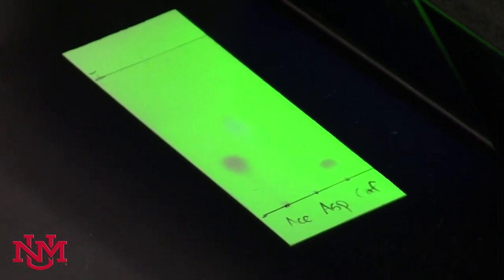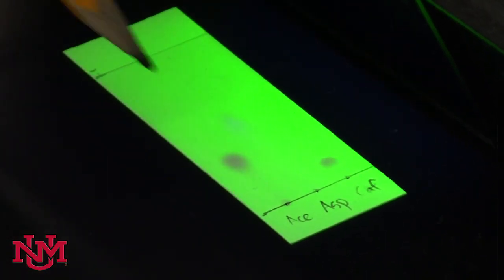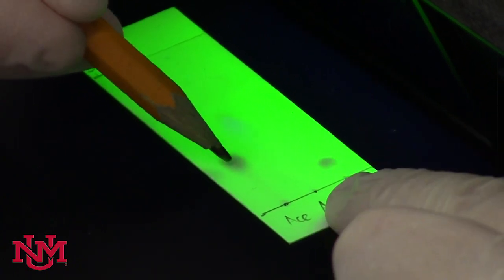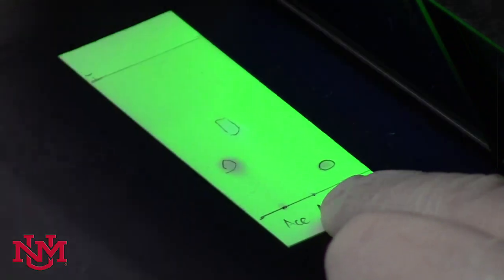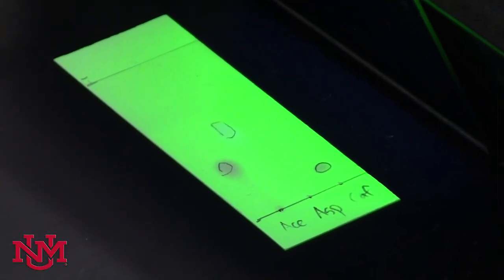Because this will fade over time, you want to gently circle the spots with a pencil and try to generally get the idea of where they're located. Then you'll have completed the visualization of the TLC plate.